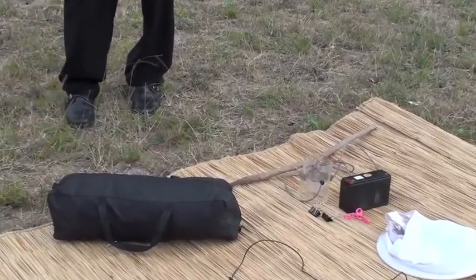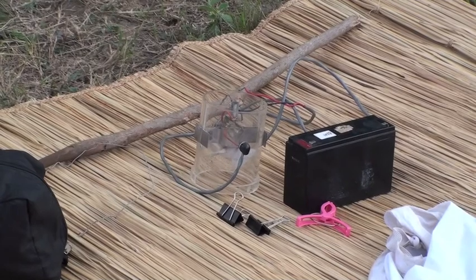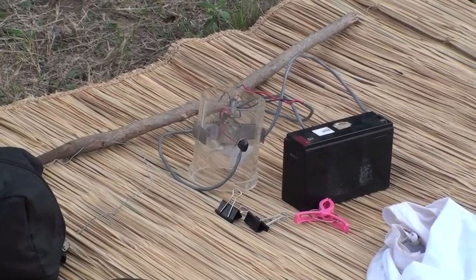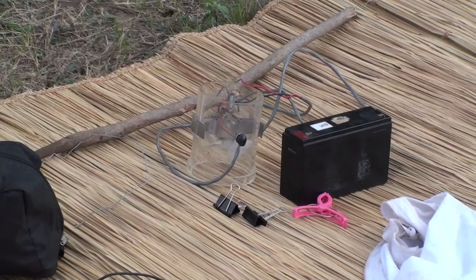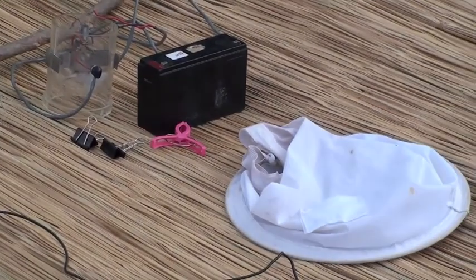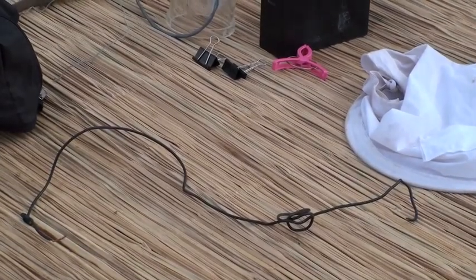A tent, a standard CDC light trap without the light, without the lid, without the grate on top, a couple or three bulldog clips or other clips like that, a collecting bag of this sort, the battery to run it, a little piece of wire and some string.